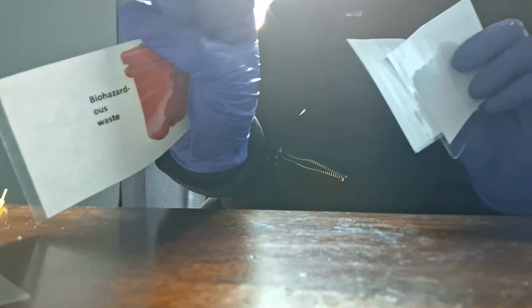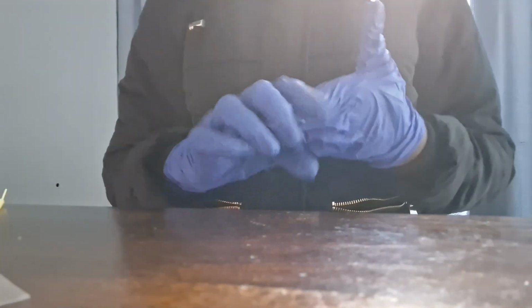After what we did before, we can now use the germicide and the paper towel, and put the paper towel in the biohazardous waste. Next I'm going to do the endospore staining.